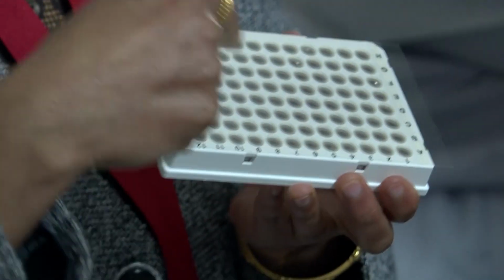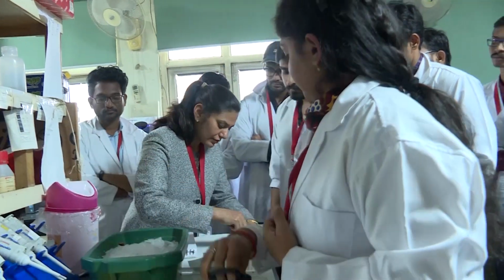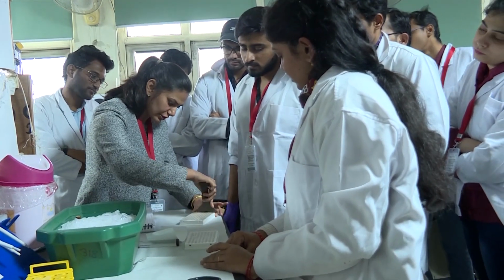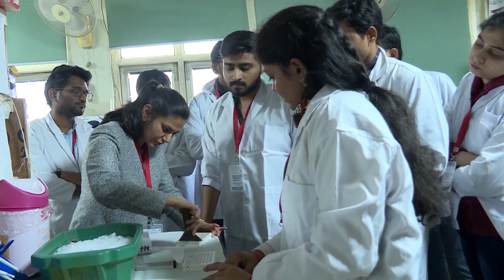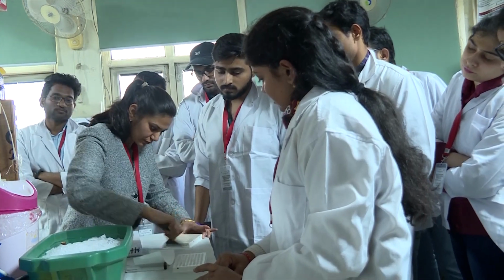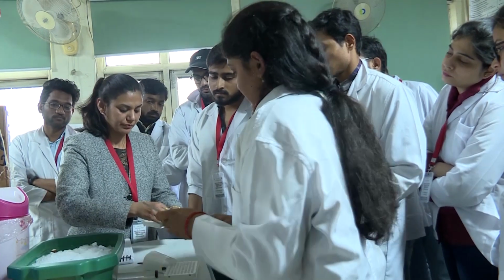So we have to take care of that. There should not be any air bubble. Okay, so we have to keep it in such a way that there should not be any air bubble. We press it properly. Seal it. Now this extra part we may cut it like so.